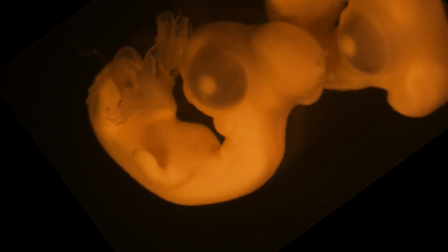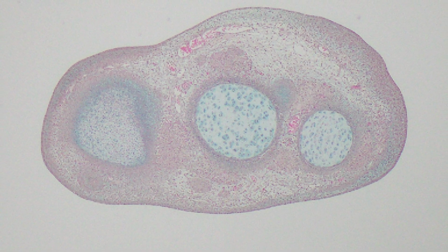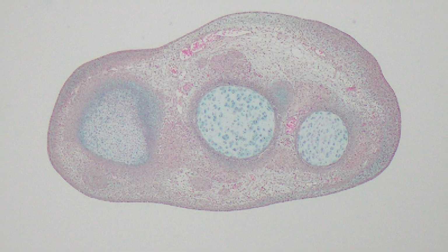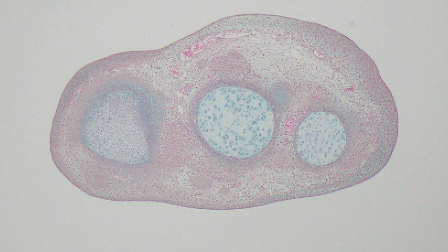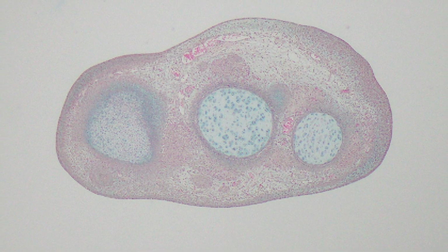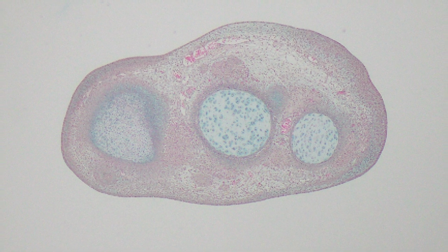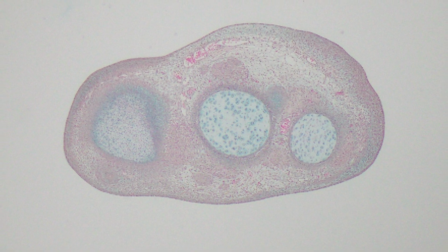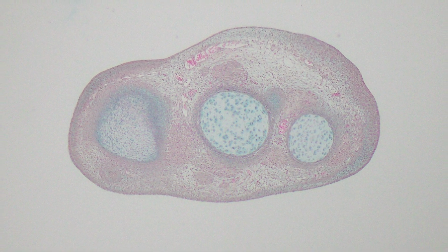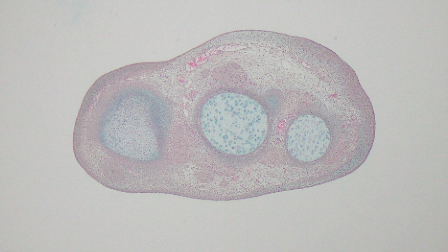And the limb buds. When you look at sections going through a limb bud, you start to see the beginnings of different tissues forming. The guide mentions observing early cartilage formation, maybe areas where cells are packing together, condensing, rounding up. That's the start of the skeleton in the limb. And you also see the precursor cells for muscle starting to organize. It really shows you how and when these distinct tissues first emerge and arrange themselves. It's a snapshot of cells making choices, deciding their fate. That's incredible, seeing that fundamental process happen.